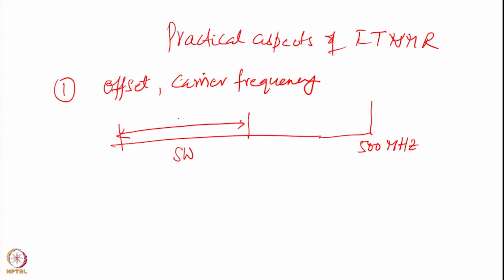We do not know how much away, because we do not know, after you apply the current, where the magnetic field has come and what is the exact frequency of the spectrometer. Some arbitrariness will be there in that. Nonetheless, what we have to do is excite the region of our interest. Region of our interest means, you remember, with respect to the spectrometer frequency, we are choosing a few kilohertz to the left and right of that.